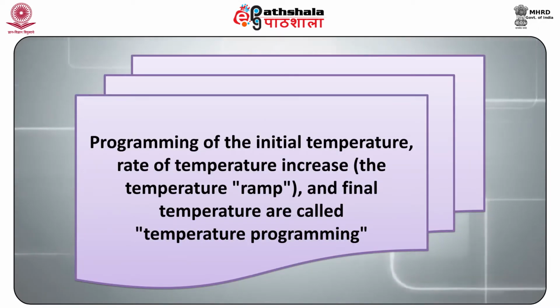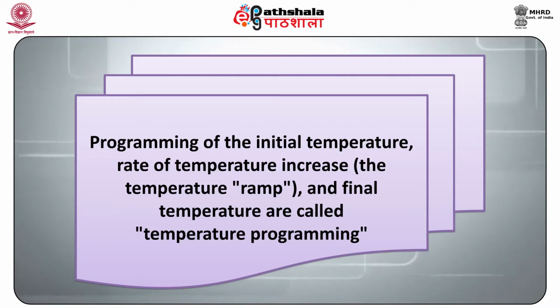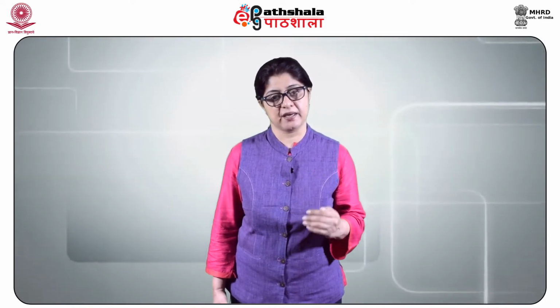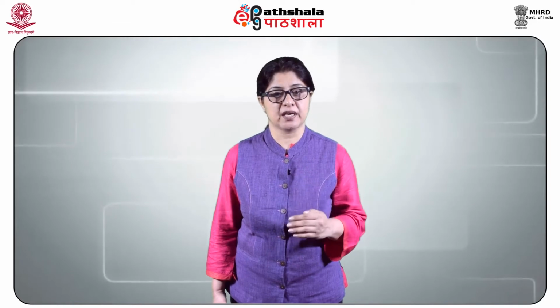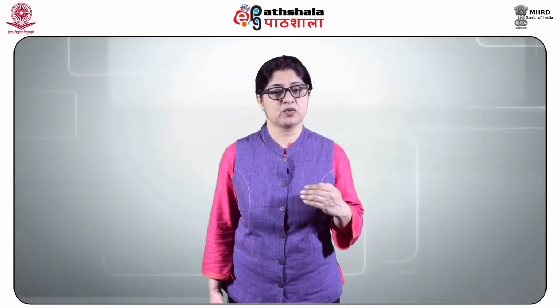Programming of the initial temperature, the rate of temperature increase, the temperature ramp, and the final temperature is called temperature programming. Temperature programming allows the analytes that elute early in the analysis to separate adequately, while shortening the time it takes for the late eluting analytes to pass through the column.